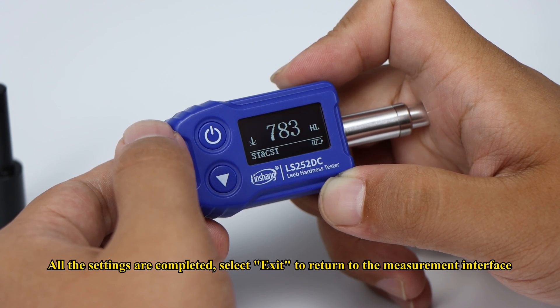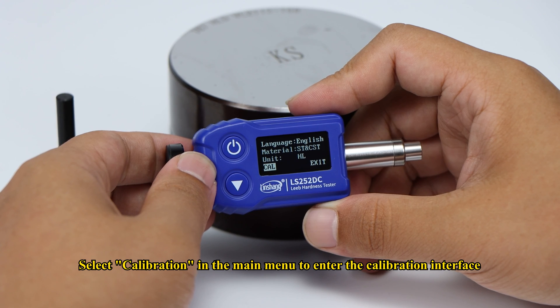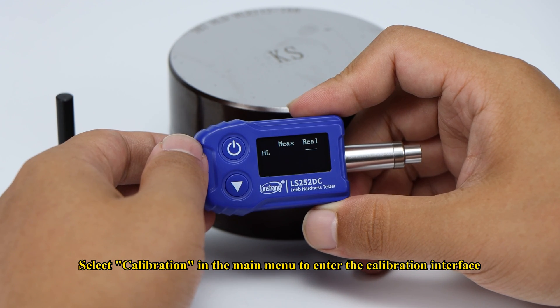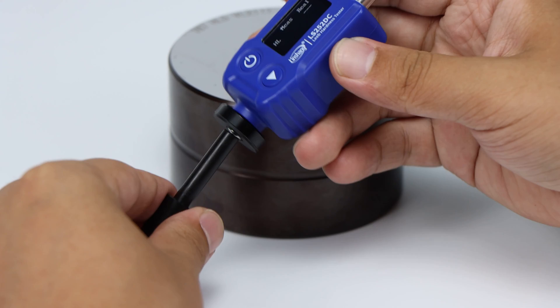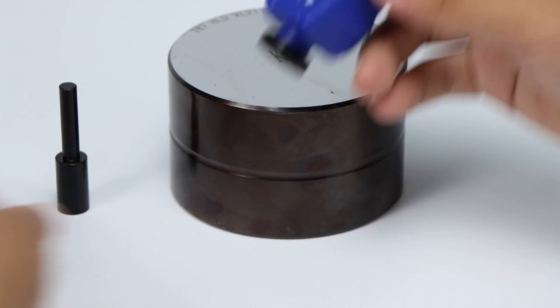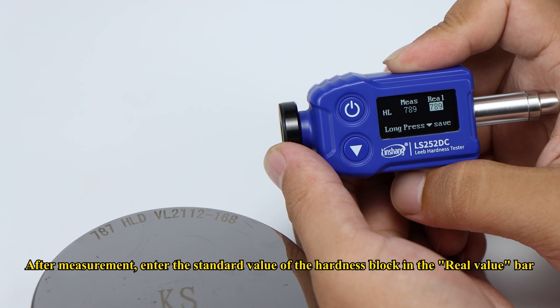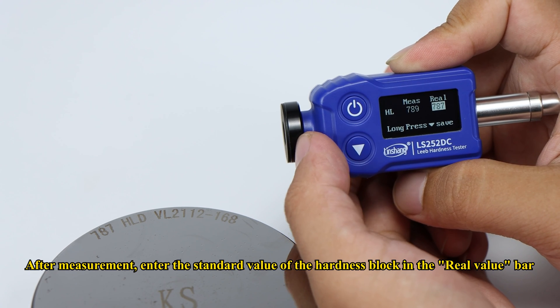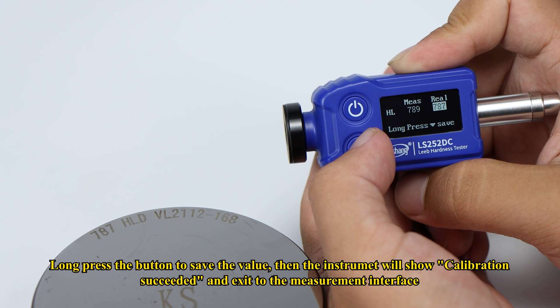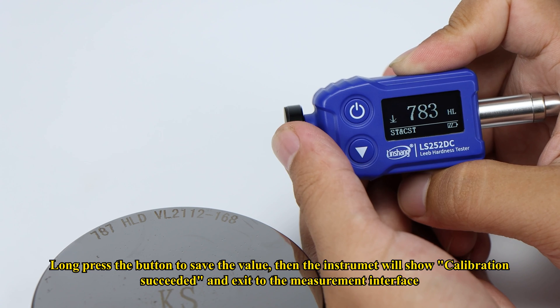Select exit to return to the measurement interface. How to calibrate the tester: Select calibration in the main menu to enter the calibration interface. The tester prompts you to test the standard block. Do as it prompts. After measurement, enter the standard value of the hardness block in the real value bar. Long press the button to save the value, then the instrument will show calibration succeeded and exit to the measurement interface.